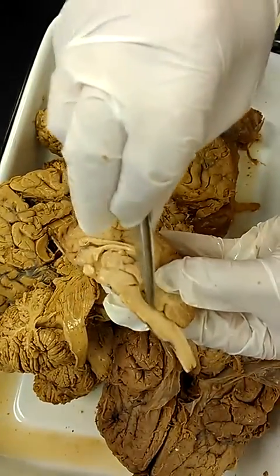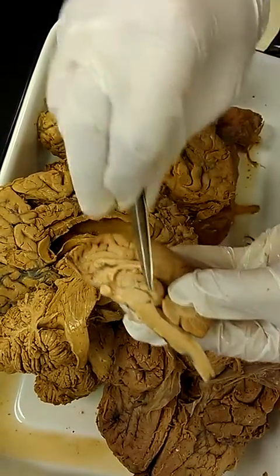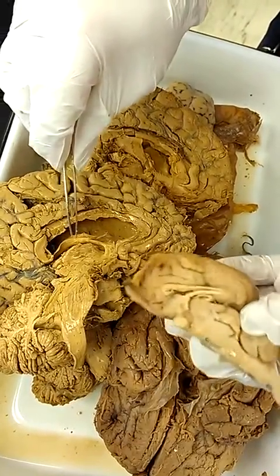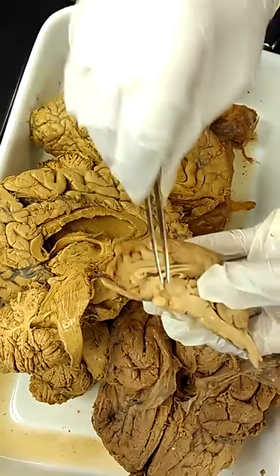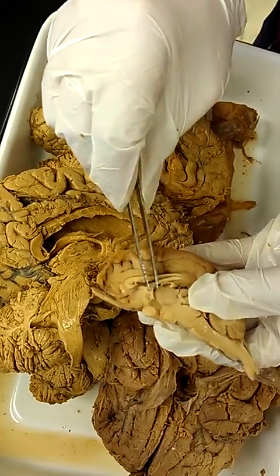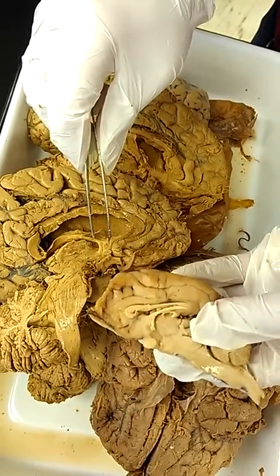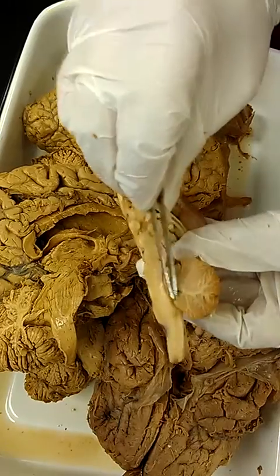So this is where the third and the fourth would come together. Okay. The thalamus is this part right here, the wrinkly area. And we already did the third ventricle, and the cerebral aqueduct is just this part right here.